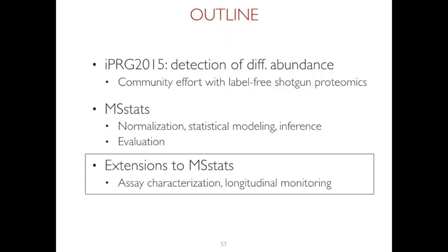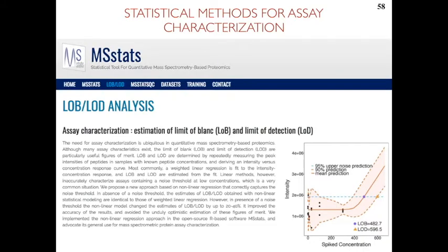And so just a couple words about the extensions to MSstats. What we talked about for the whole morning is really the base functionality, which focuses on detecting differences between conditions. But we actually have several group members who are interested in other topics related to this. So I just wanted to highlight two parts.